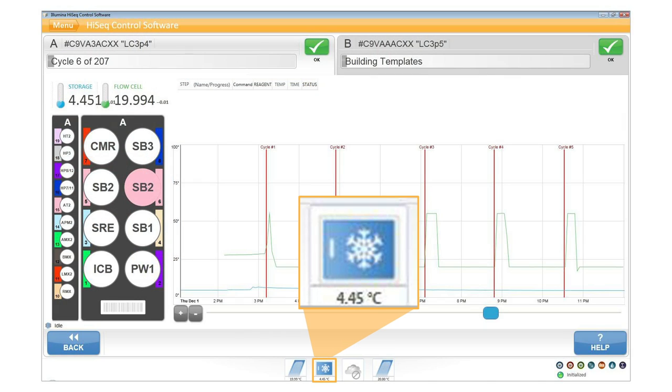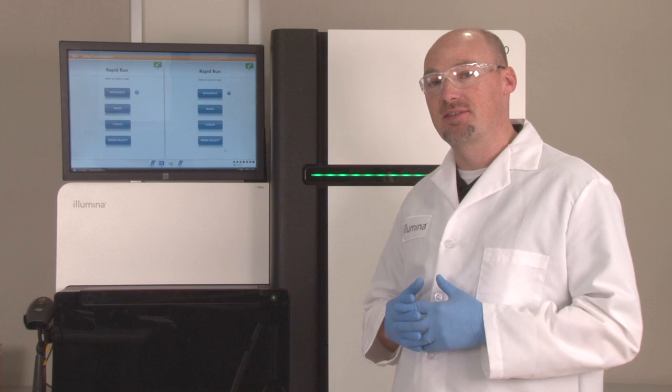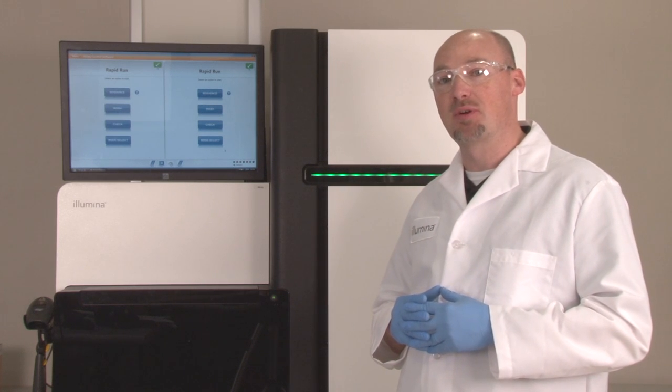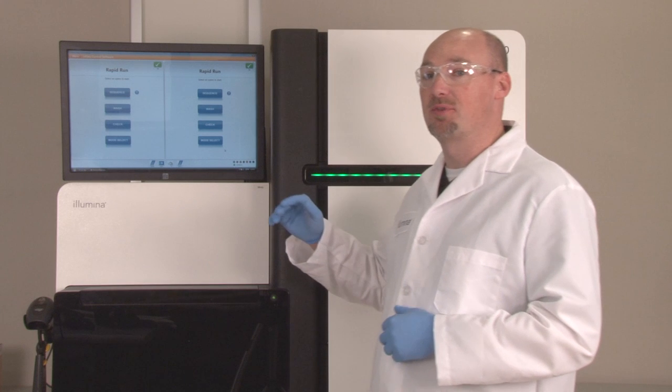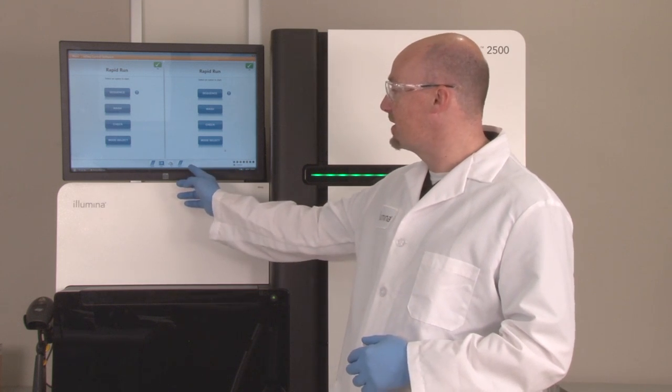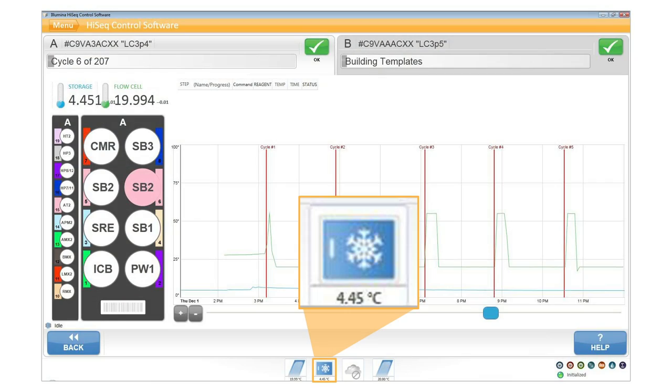While the instrument is running, make sure to monitor the chiller temperature. There is no high temperature warning message, so contact your Illumina support team if you see the chiller temperature rise above 7 degrees Celsius for an extended period of time.